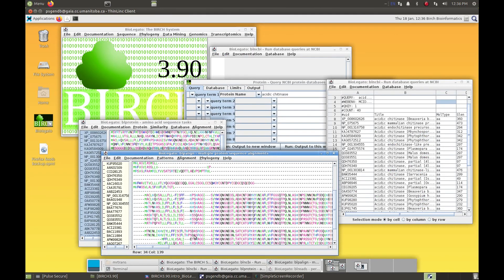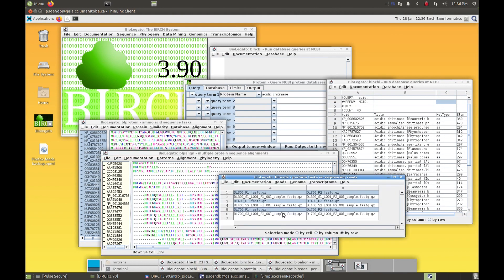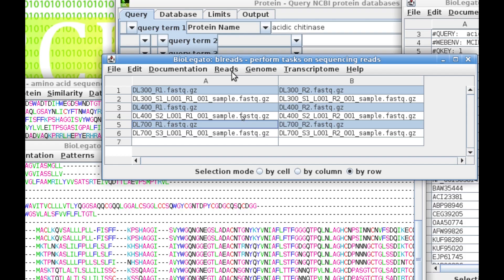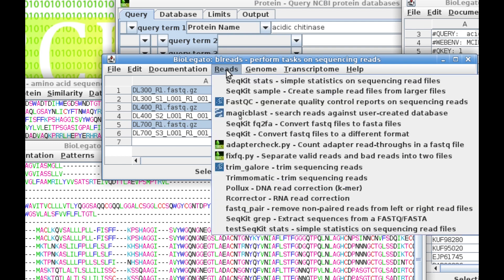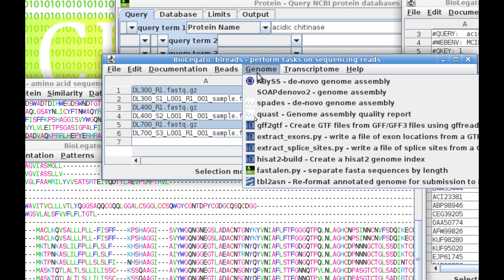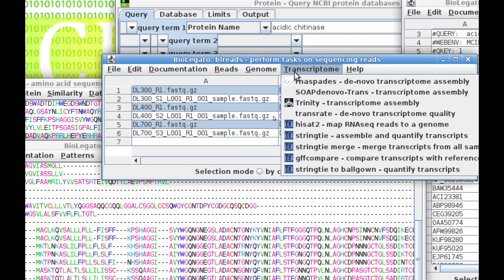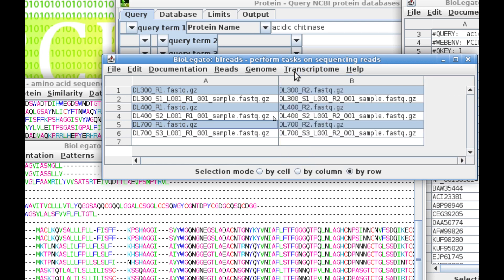To illustrate the versatility of BioLegato, BLReads does most of the important genomic tasks that involve sequencing reads. BLReads brings together a very large number of applications that do quality assurance and quality control on reads, genome assembly and evaluation, and transcriptome assembly and evaluation.